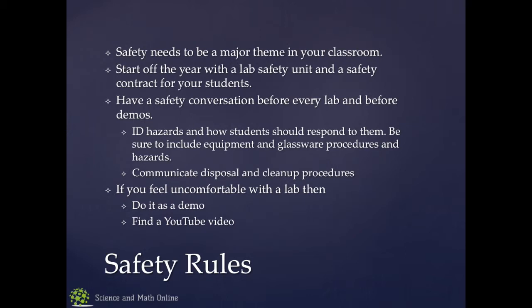Okay? There are times when I'm doing a demo that I want them to touch something, or I want them to have a safe, closer look. They've got to have their goggles on, and then they can look closer, but they got to do it the way I tell them to do it. If they start going where they're not supposed to go, or touching something they're not supposed to be touching, I'm going to have a fit. Okay? Which reminds me, when kids go in the lab, they need to know they don't touch anything until you tell them to touch it. It's a critical safety rule. And so that's just some tips on lab safety.